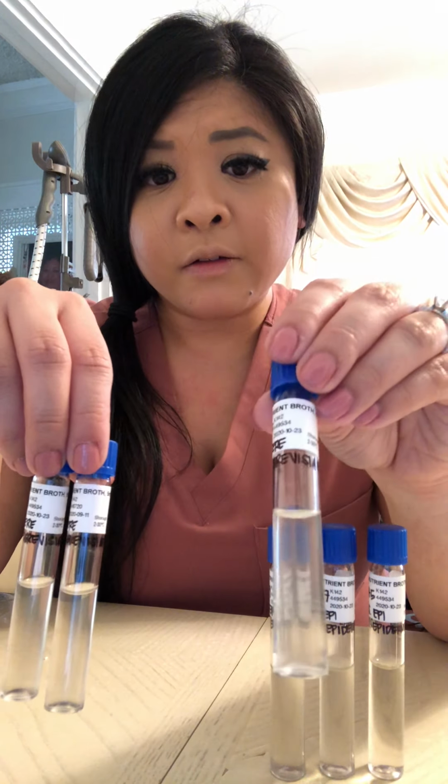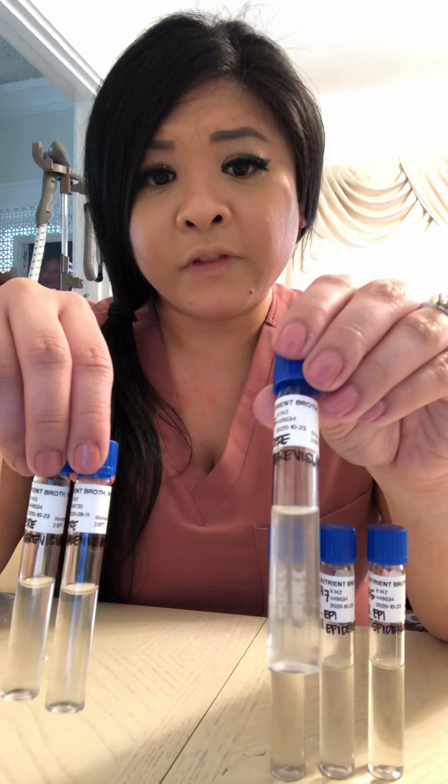Next, I have my S. cerevisiae vials at pH 5, pH 7, and pH 9, which you can see are all equally turbid, which indicates that S. cerevisiae grows in a pH of 5, 7, and 9.